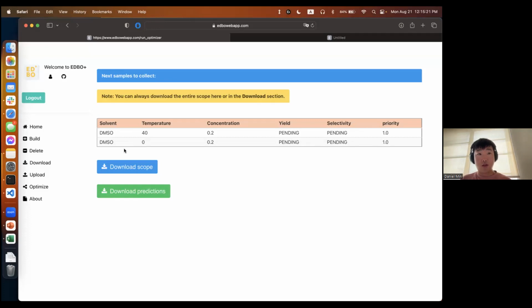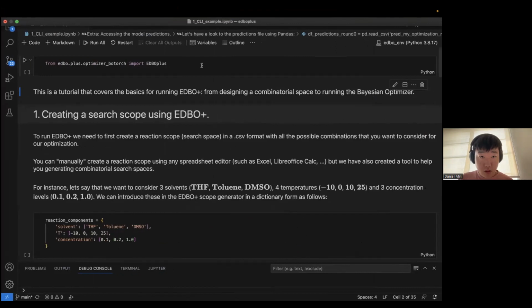And yeah, so next I will move on to our Python interface. Oh, you should be seeing my code. Okay, there you go. So again, you can get this code from our GitHub. I was just in the slide, which I could share as well. This tutorial itself is also in the GitHub under examples tutorials, but I will go through this with you.